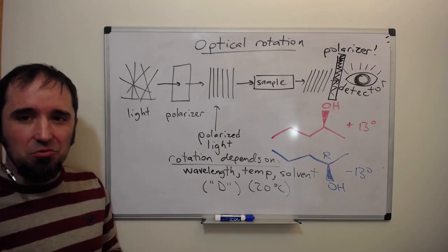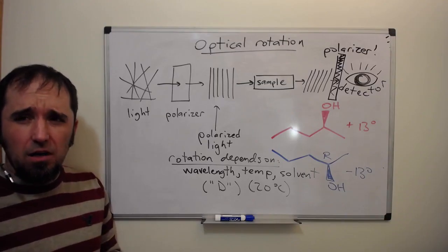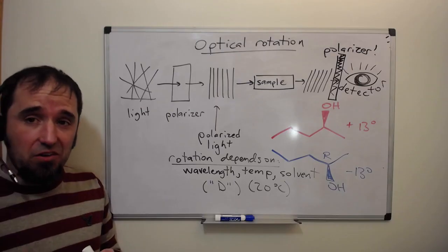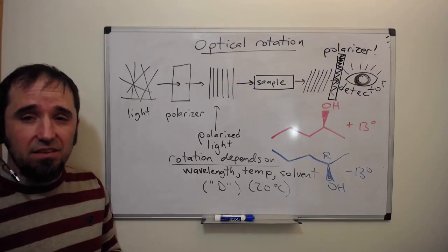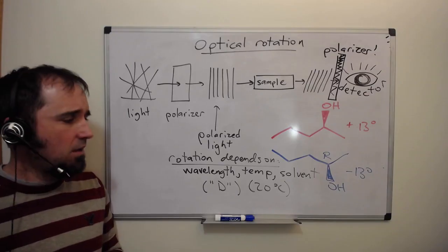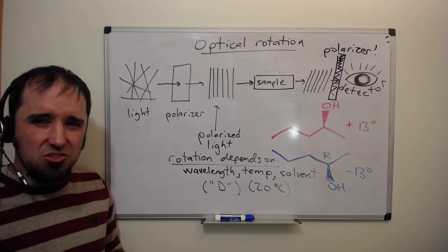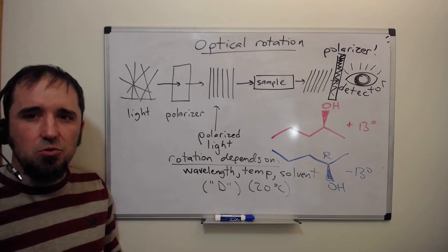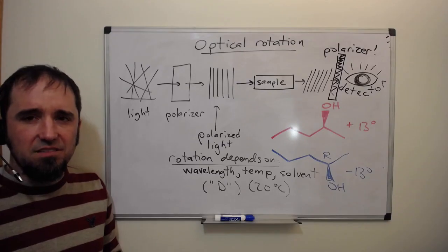That is the old-fashioned sodium lamps that burn a very bright yellow. If you've ever melted glass, you know that glows yellow. That line is the sodium D wavelength. It's in the 500 nanometers range. And usually these things are measured at 20 degrees Celsius. So they're not strongly linked to temperature, but technically it is temperature dependent.